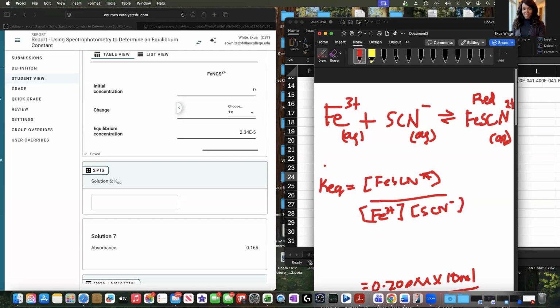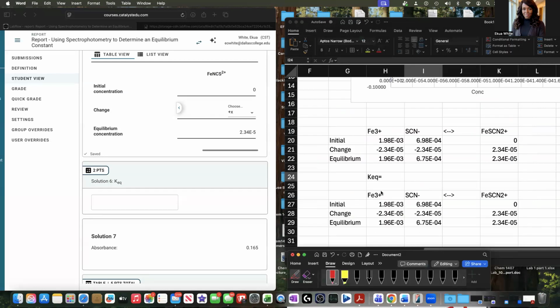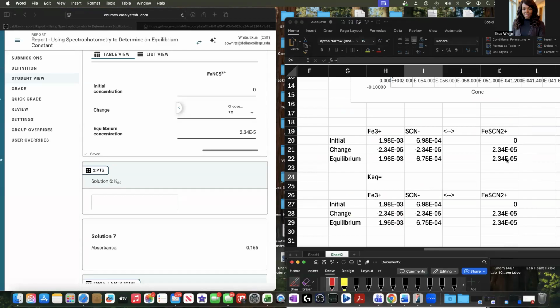Okay. So I need to have columns that have these numbers, right? Let me see if I can translate that in here. So it's the product first. So from here, I need this number here. So this is equal to this number, product, right? Divided by, where's the divide?